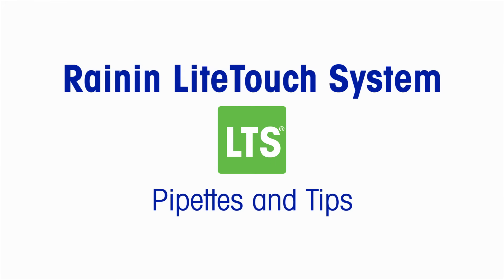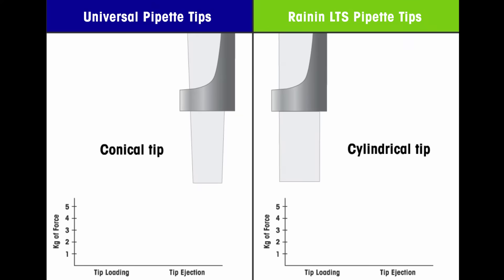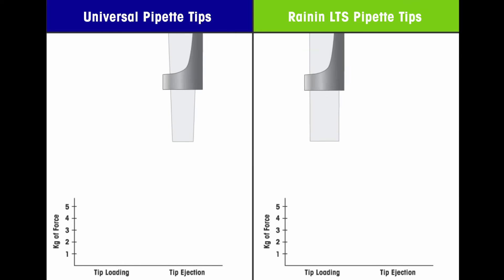Rainin Light Touch System LTS Pipettes and Tips. Universal tips fit traditional cone-shaped pipette nozzles. Rainin LTS tips fit LTS pipette nozzles, which are cylindrical.